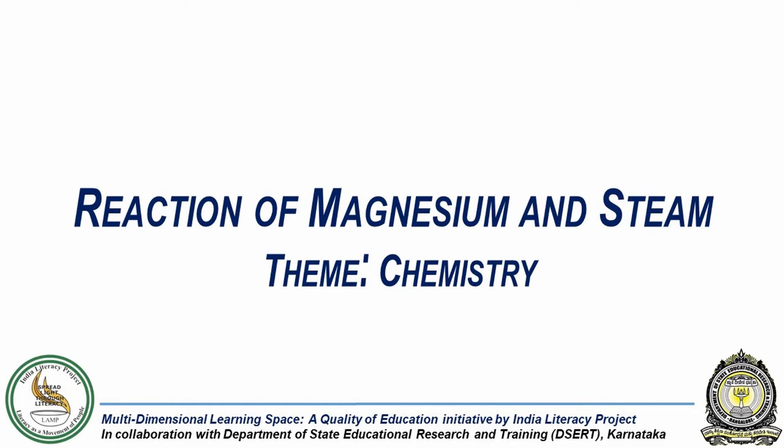In this experiment, we will study the reaction between a metal, namely magnesium, and steam.